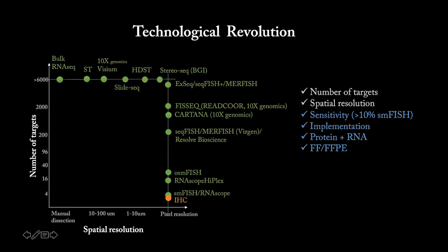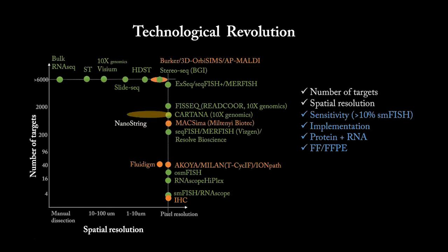And next, because we work on proteopathy, there is a lot of information that cannot be acquired by multiplex RNA detection in situ. We need the detection of the protein, such as immunostaining. And here I show you the technology that helps us to multiplex the protein detection in situ.